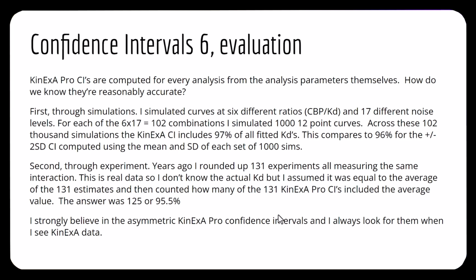So I strongly believe the asymmetric KinExA Pro confidence intervals are superior, and I always report them that way. But I acknowledge that if you want to do the extra work and measure your system several times and do a mean and standard deviation, in terms of a 95% confidence interval, it's likely to be okay.